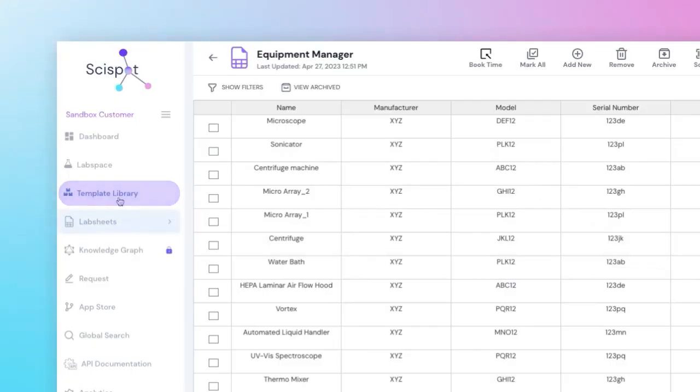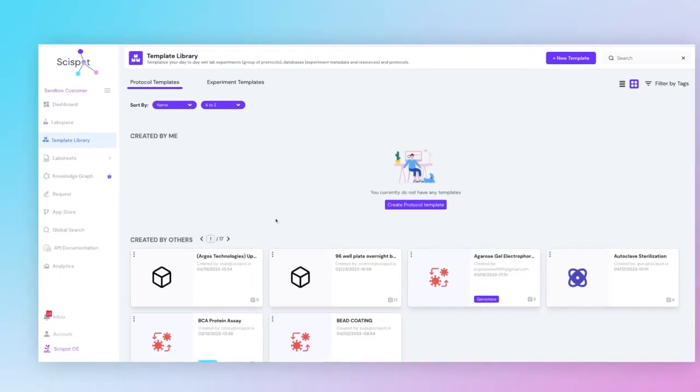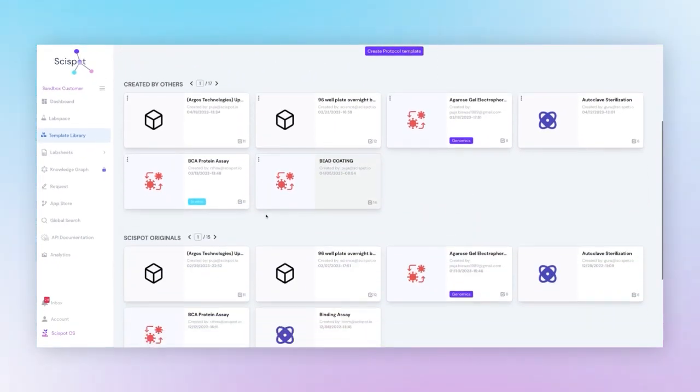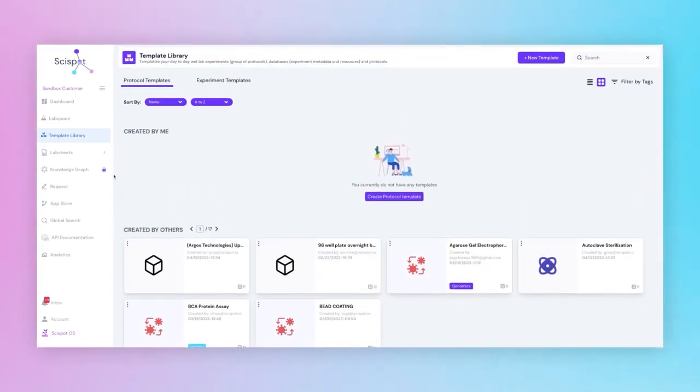We also have a template library where you can templatize your workflow and use it as a starting point for your daily runs.